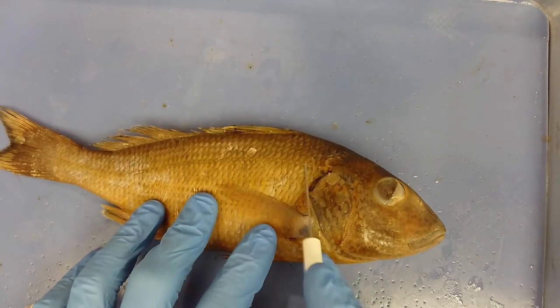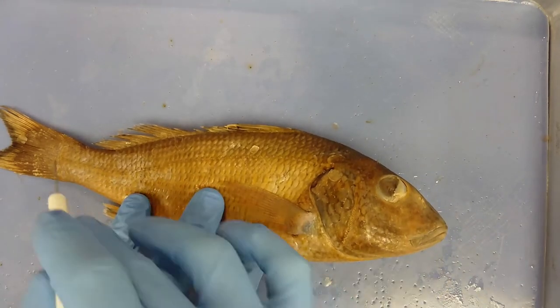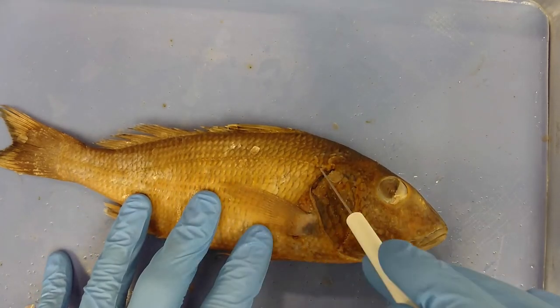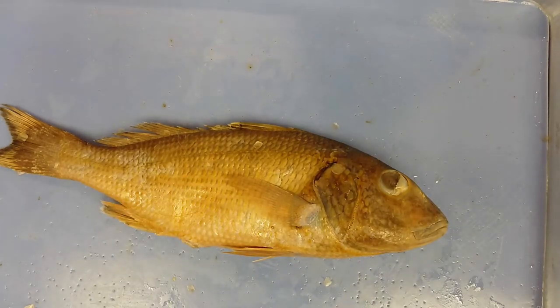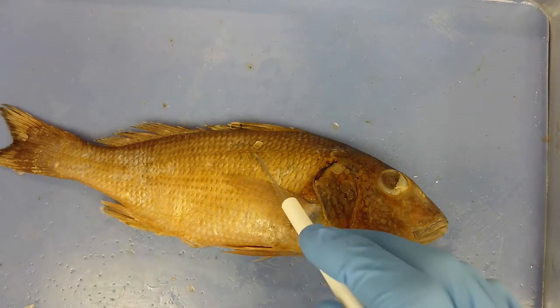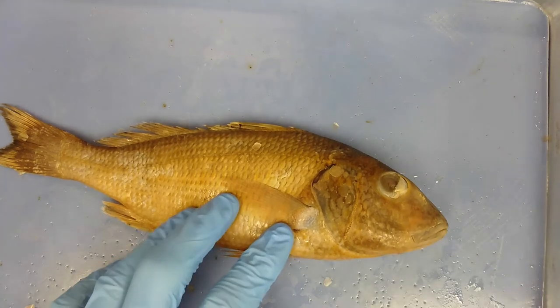Another sensory organ on the outside of the body is the lateral line system. This line of scales has pores that allow water to flow in, and each pore has a canal with a cell at the end bearing a flagellum. When a pressure wave hits the lateral line, it moves that flagellum, which the fish interprets as a nervous impulse sent to the brain.